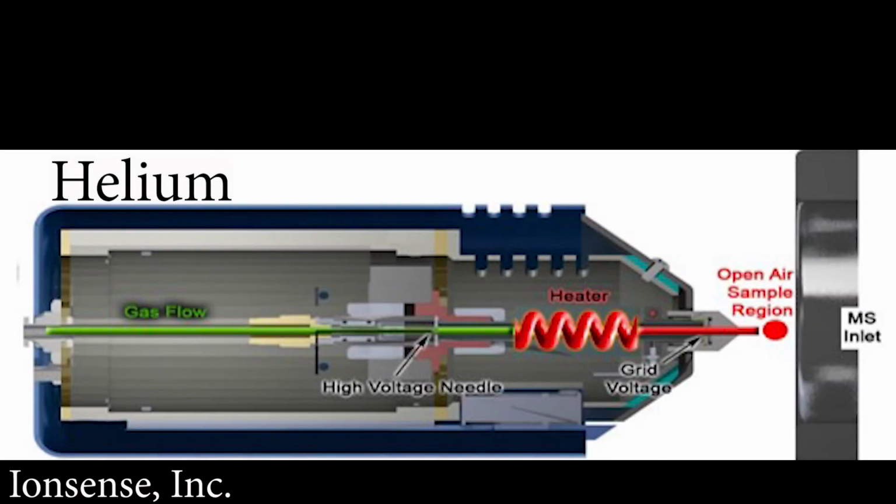So the first ambient ionization source we'll talk about will be DART, and that is the source we were just looking at. I really like DART, and it's the ambient ionization technique that's been most widely adopted by the forensic science community, particularly forensic chemistry.